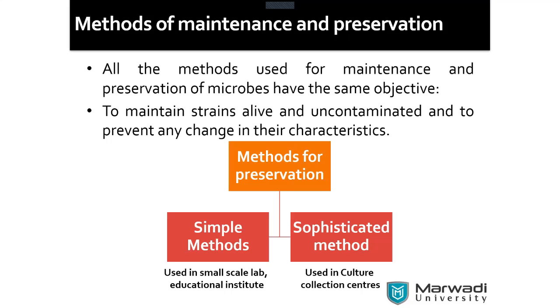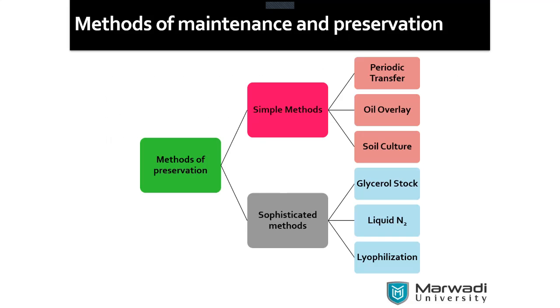Basic methods: one is a basic simple method, and one is sophisticated. The simple method is periodic transfer. Yesterday we worked with some cultures.